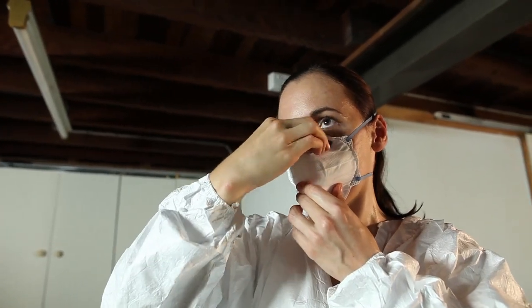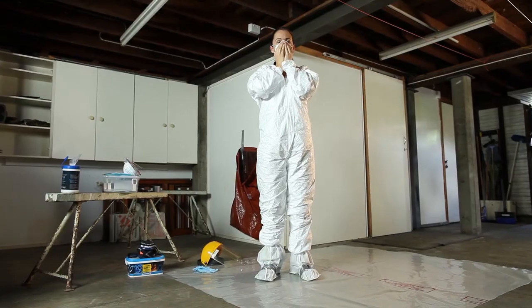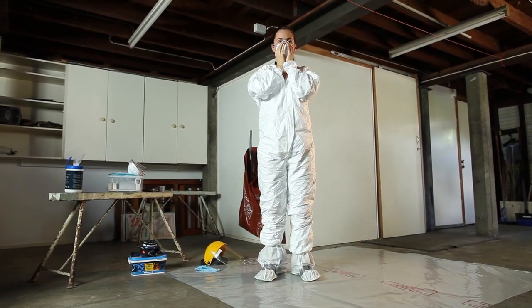To ensure there is an airtight seal, make sure your face is clean shaven. Fit checking will determine if the respirator seals correctly and can be done in two ways, depending on whether your respirator has valves. If you're using a disposable respirator and it does not have a valve, place your hands over the respirator and breathe out hard. If the seal isn't good, you'll feel air leaking out from the edges of the mask.